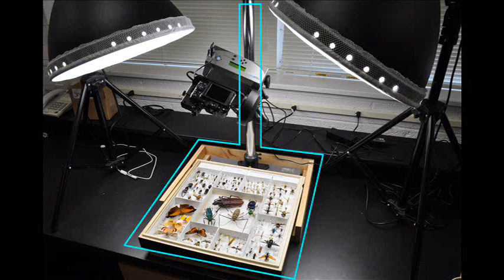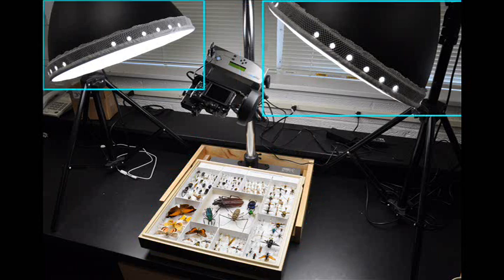The robot plus camera are then attached horizontally to a copy stand that is fitted with a custom jig to accommodate insect drawers. Lastly, lighting is provided by two continuous compact fluorescent lamps, each with nine bulbs producing daylight spectrum light.